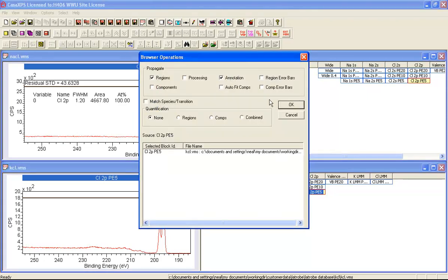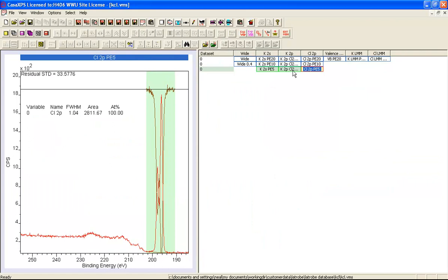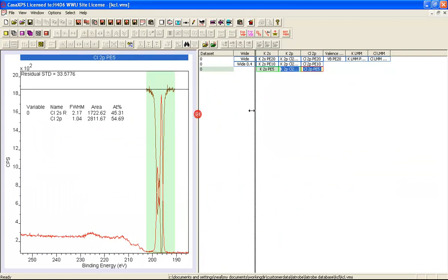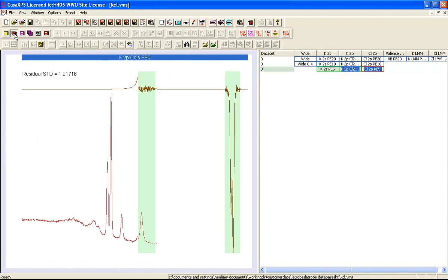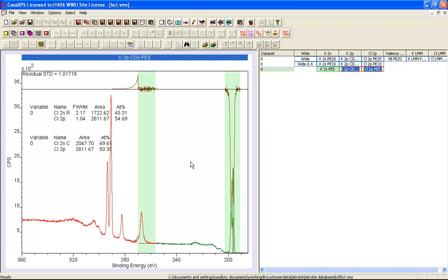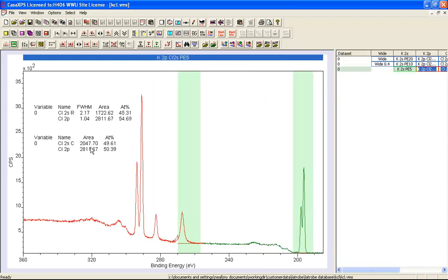Propagate from the top one which is the region and we don't need to propagate the components, there are none. The annotation will do that also. So we now have a region here. Let's have a look and see what the quantification looks like. If we introduce a background and a Lorentzian without adjusting too much we've ended up with something that once again is in much better agreement with what we'd expect. We should get 50-50.